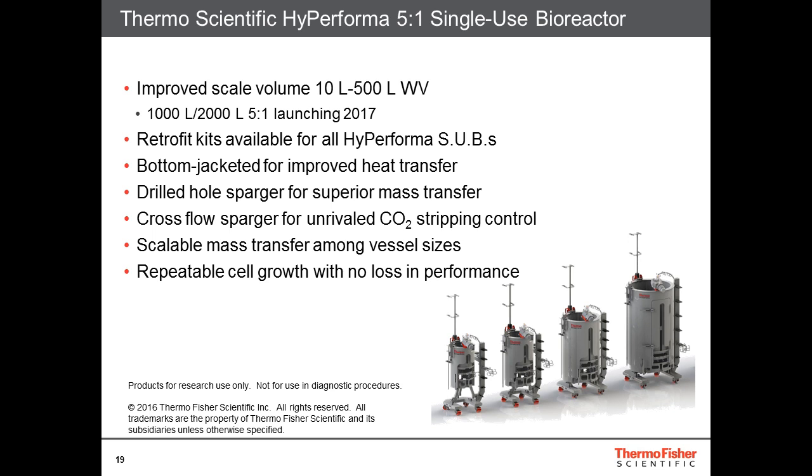So in summary, it is not just important that in any bioreactor, if you just reduce the volume, you will be able to operate at 20% or a higher turn-down ratio. It is also important to understand the culture performance, and accordingly, this cross-flow sparging, and then some of the other aspects, like temperature transfer, become very important aspects in running the bioreactors at lower volume.